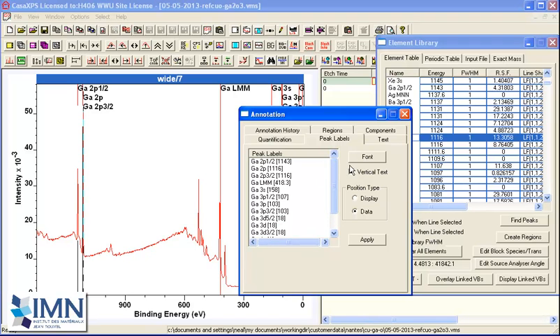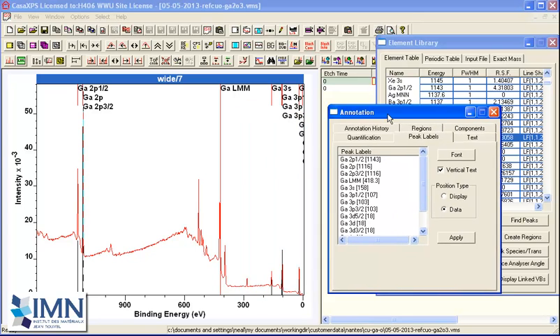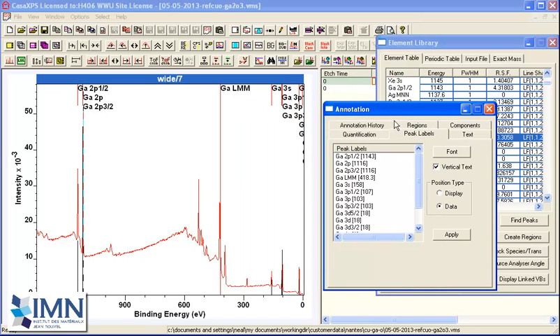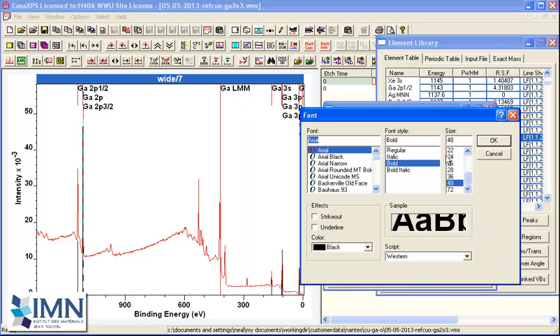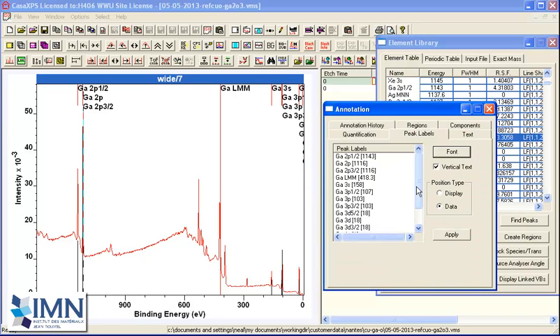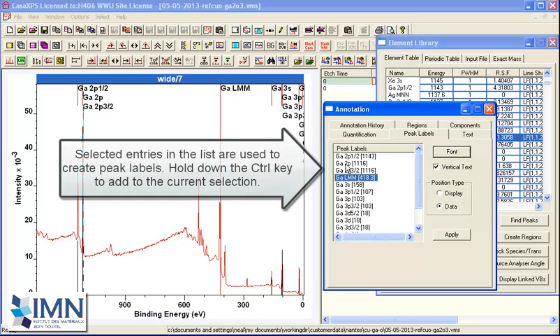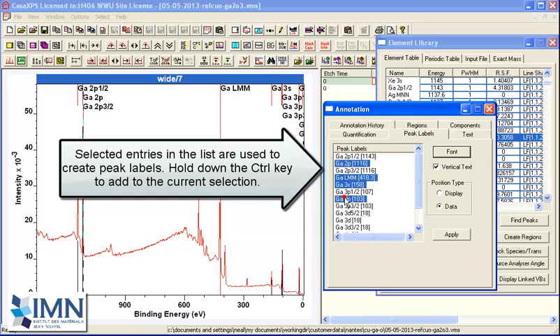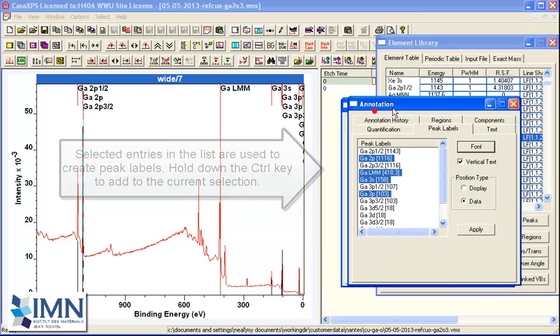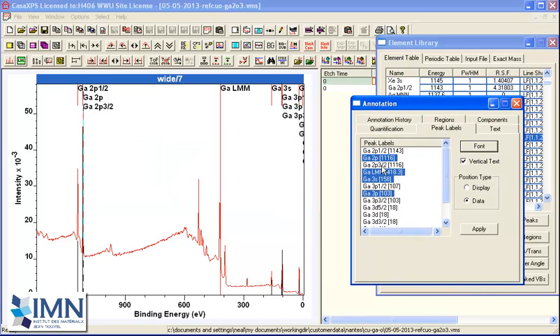So if we wanted to label some of these gallium peaks, what we would do is select a font - let's make this 36 - and indicate, holding the control key down after I've made the first selection, a set of peaks that I would like to add to the display. So I've now created four selected transitions.